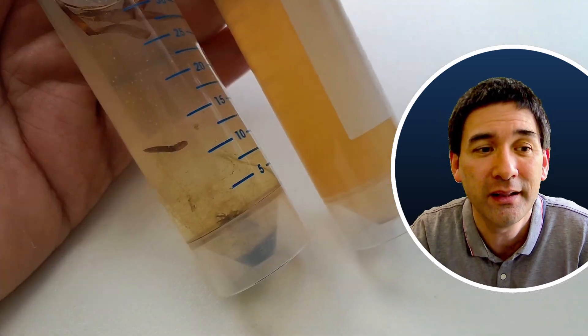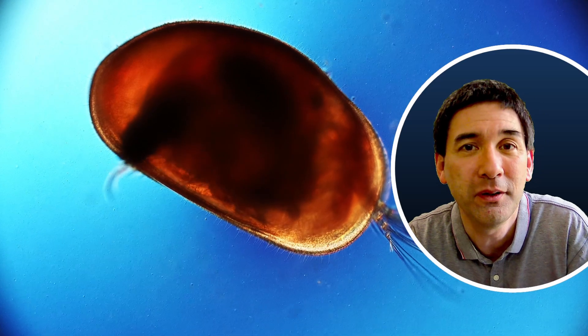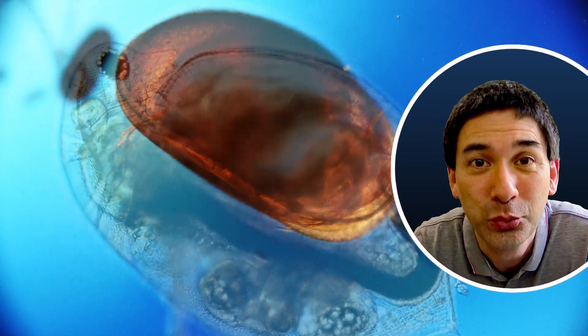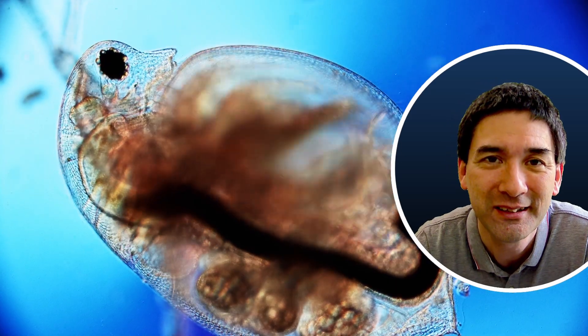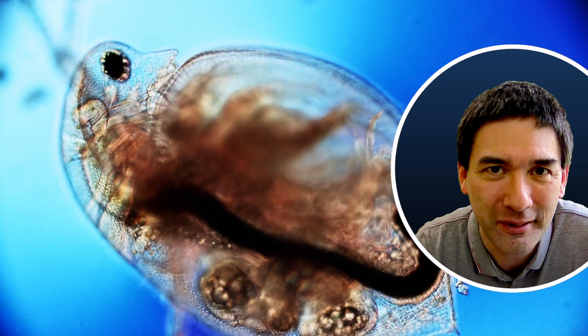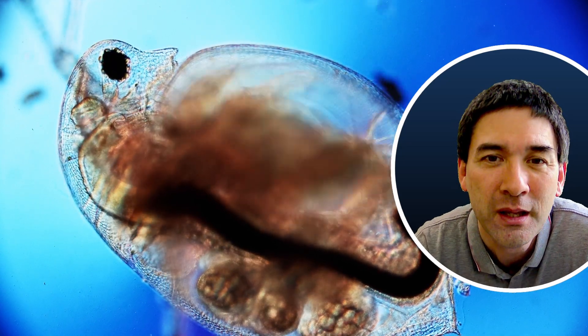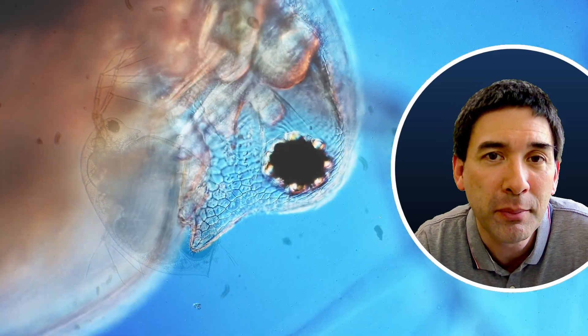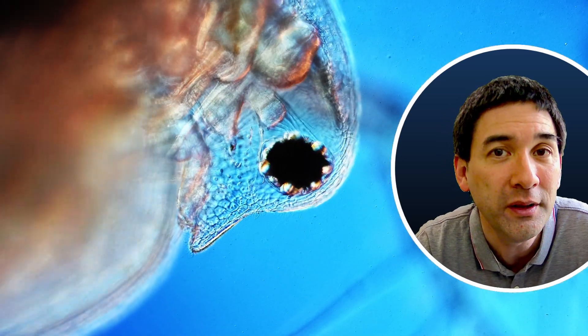Under the microscope, this is basically what I saw — evidently the food was plenty, because they digested and ate a lot and produced quite a lot of waste. There were a whole range of different water crustaceans in the sample: there were daphnia, there were ostracods, and other water crustaceans as well.